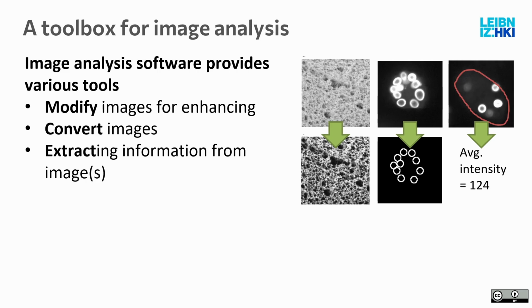When you are working with image analysis software that is not fully automated, anyway, they usually hide it away, usually these commercial software, but more like ImageJ, where you have more control. You have different kinds of operations, usually ones that modify the image in some way. For example, we have here this contrast enhancement. This is modifying the existing image, enhancing it, but it stays the same image.